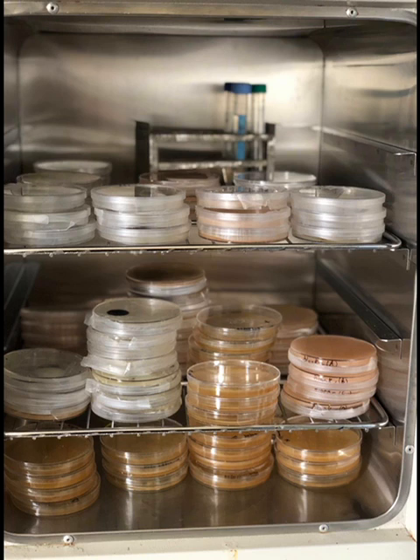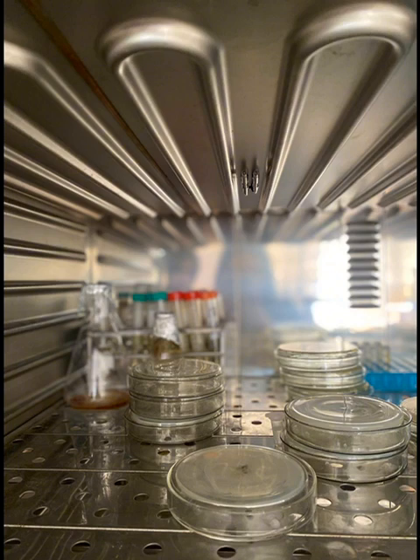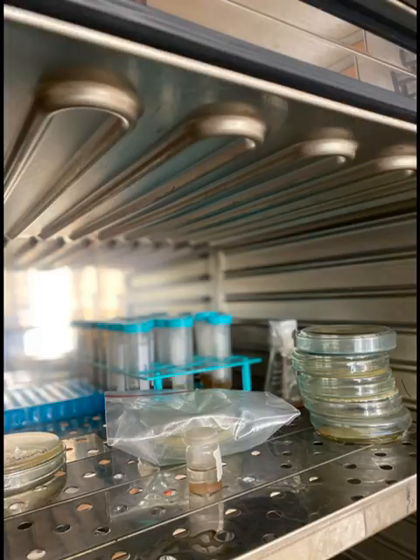Growth incubators maintain a stable temperature conducive to the growth of the specific microorganisms or cells being cultured. Incubators provide a controlled, sterile environment necessary for culturing microorganisms. By placing petri dishes in the incubator, the risk of contamination from airborne particles or other sources is minimized. Incubators help maintain the appropriate humidity levels within the petri dishes. Adequate moisture is essential for the growth of microorganisms and prevents the drying out of agar-based culture media.